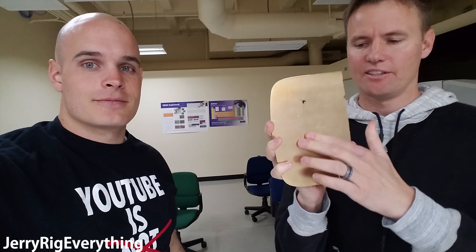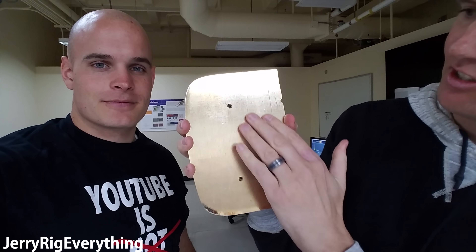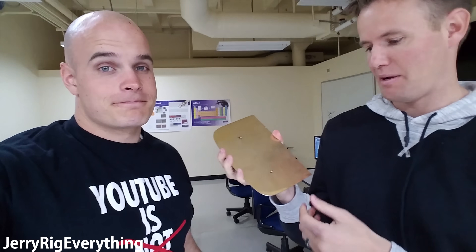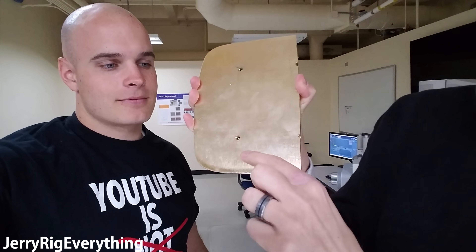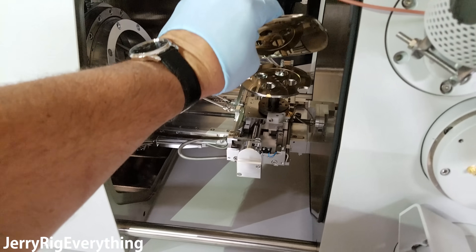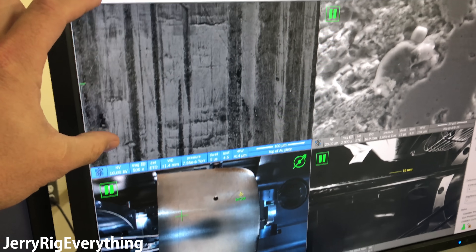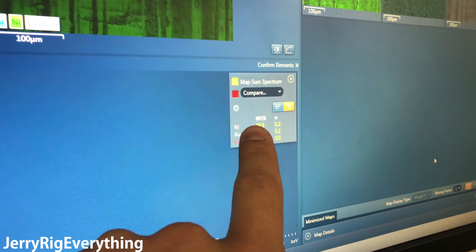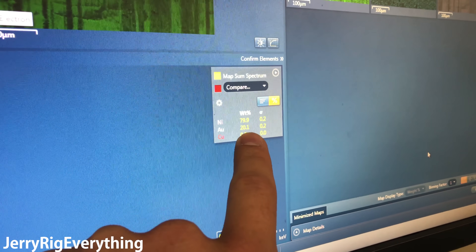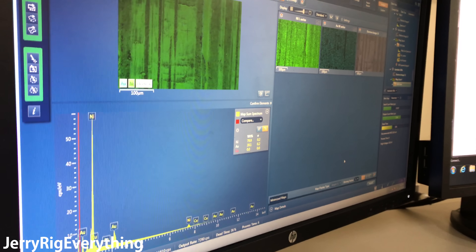The back's not as shiny — it just has scratches on it and it's flat. Check the front: it's shiny and glossy. We might be on to something. You can see the shine comes around the edge right here, but not on this part. Right now inside the machine we have the back of the gold play button. Looking at the composition graph, we still see nickel, but there's actually a larger percentage of gold on the back of the button than we saw on the front, which is very interesting.